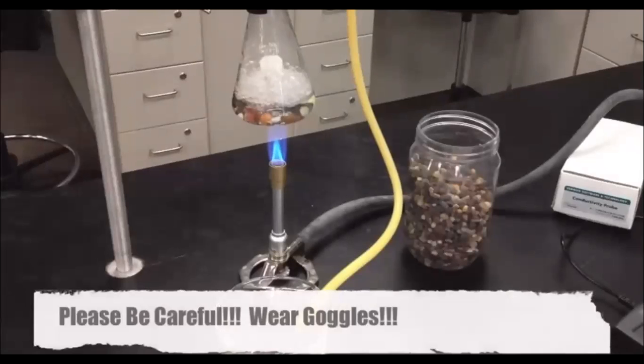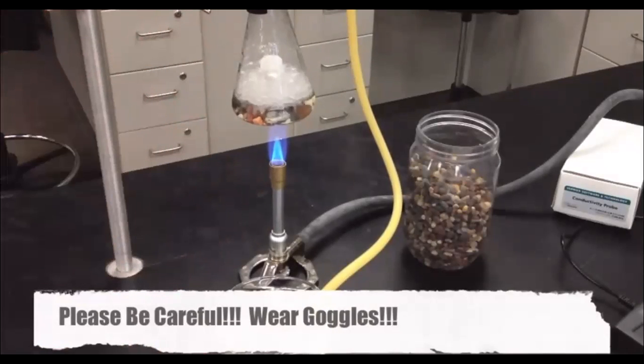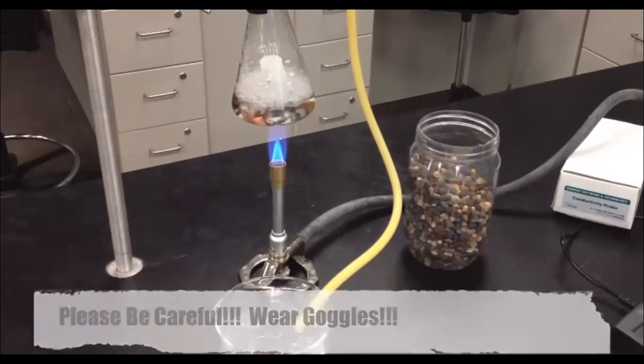Again, just be very careful. This is a potentially dangerous situation, so please just don't sit on your iPad and play games. Obviously, you never want to do that, but this is something you need to keep an eye on here. We've got very hot steam, we've got boiling water here, we've got a potential pressure situation if this gets backed up, so just make sure you're monitoring this the entire time it's happening.